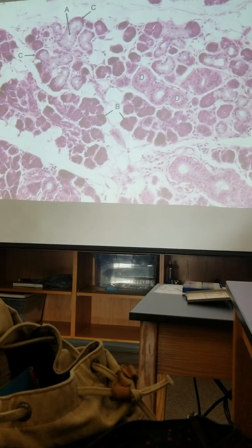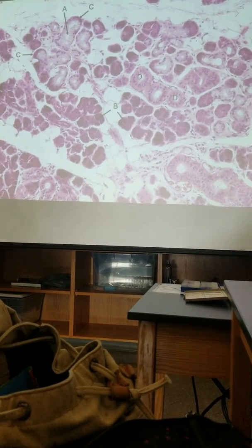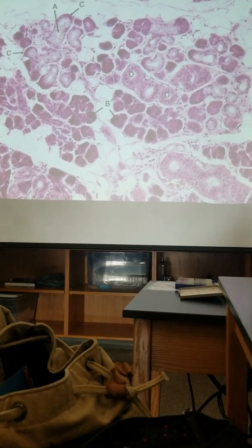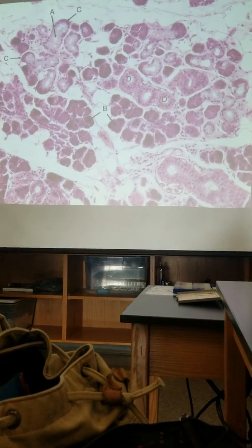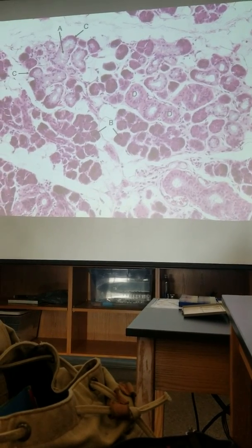Serous demilune. Yeah, serous demilune. Can you just put demilune, is that okay? It's a half moon what, though? It's a serous demilune. D would be D for duct.